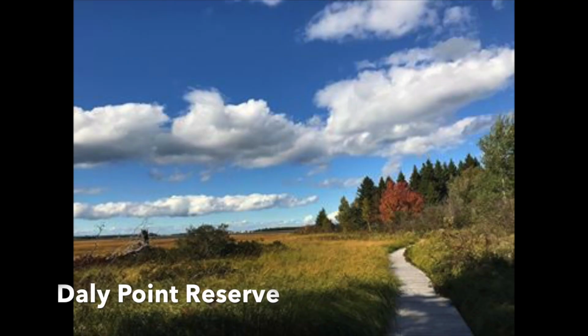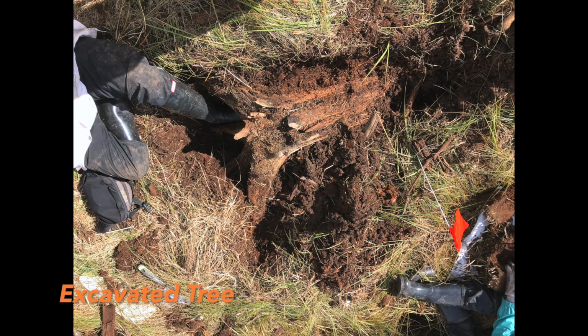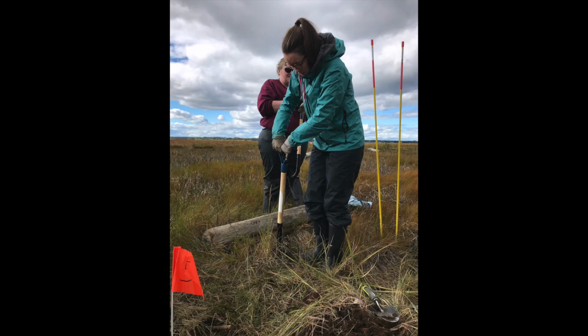We use palynological techniques at the salt marsh on Chaleur Bay within the Daly Point Reserve in Bathurst, New Brunswick. We wanted to analyze the vegetation history of the area, so we chose to do a small-scale study of a tree to see if it grew in a terrestrial or freshwater wetland environment.